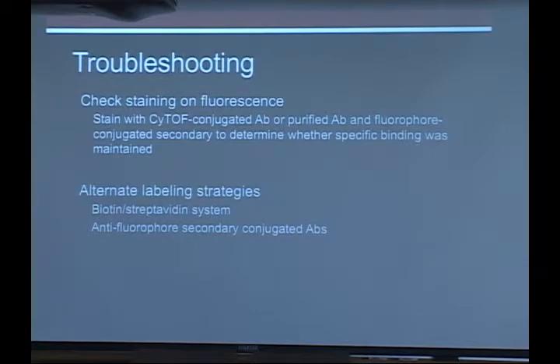Or the other thing that we can do in the lab is to use a fluorophore-conjugated antibody. So you could take, say, the antibody that you're interested in measuring on a common channel like PE or APC and use that antibody, and then come in with a secondary antibody that's metal labeled, targeted against the fluorophore. So that's another trick to get around using clones that don't seem to be performing that well.